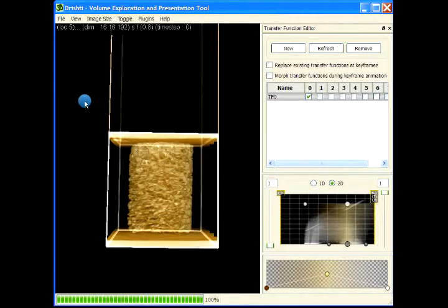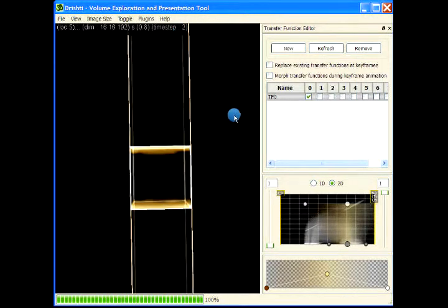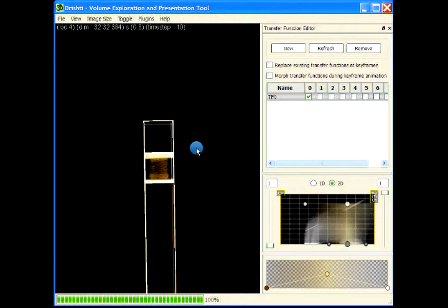So let me press Z. I'm pressing Z, and you can see it's the time step that is changing. What is really happening is this box is moving up like that. So I'm pressing Z and then Shift+Z. That way you can quickly navigate between different time steps.